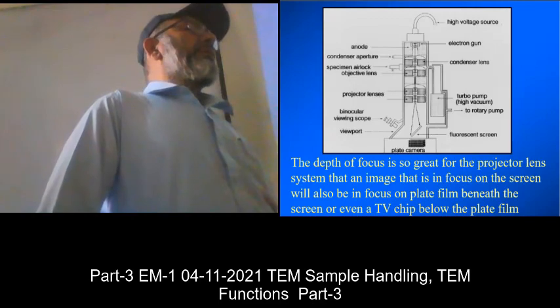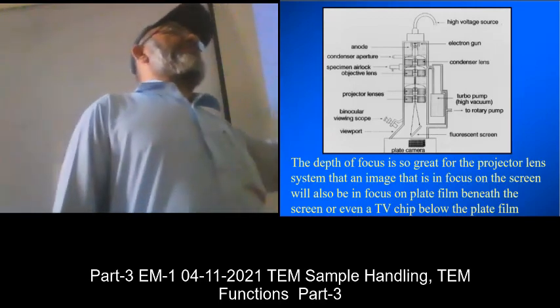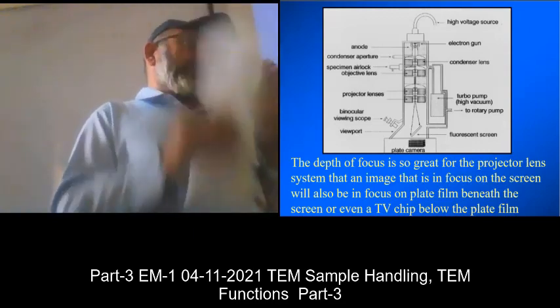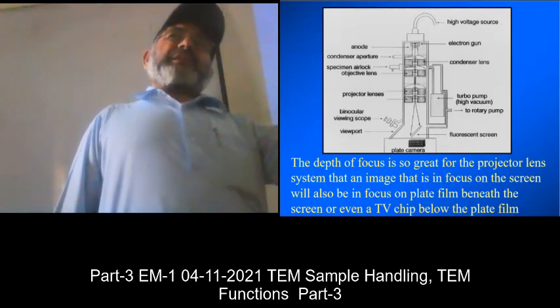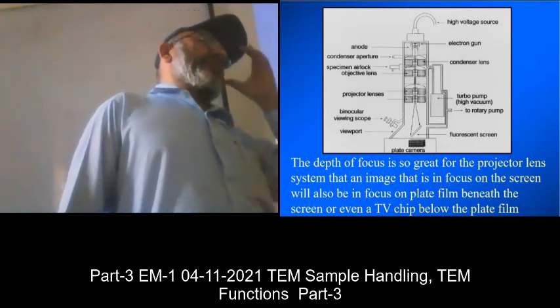Is that a reflected electron beam? No. This is just magnifying the screen for us. When we look into it, whatever is present on the screen appears 10 times larger in the binoculars.